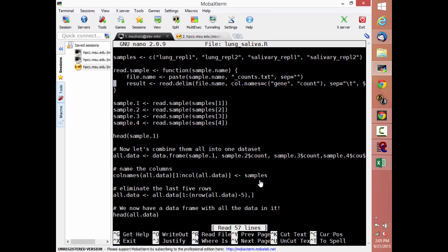There's an equally as useful but slightly different set of statistical tools called DE-seq that does differential gene expression analysis, differential expression out of sequencing, which was built, I think, de novo for sequencing only as opposed to EdgeR, which, as I probably mentioned, was based first around microarray tools, was adapted to RNA-seq, etc. So there are two tools.